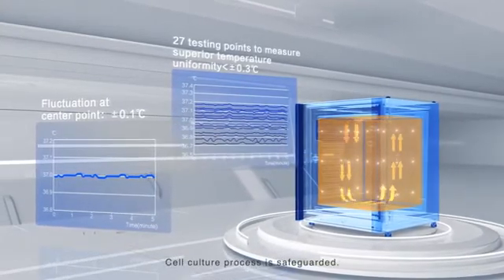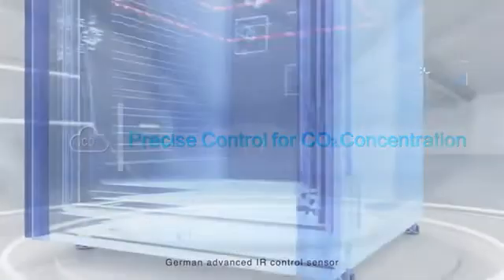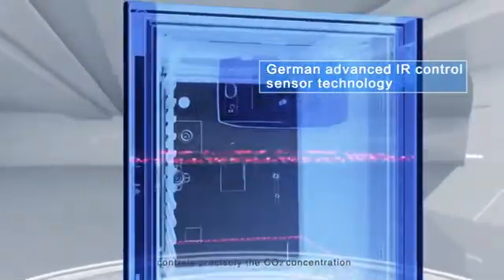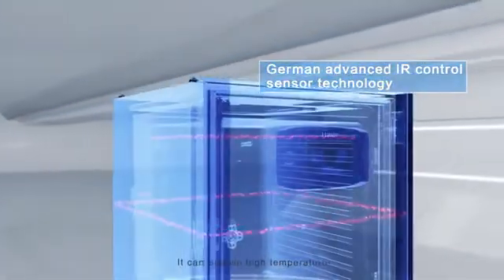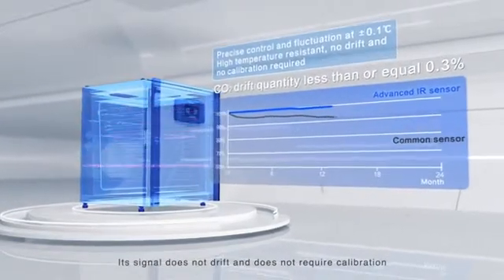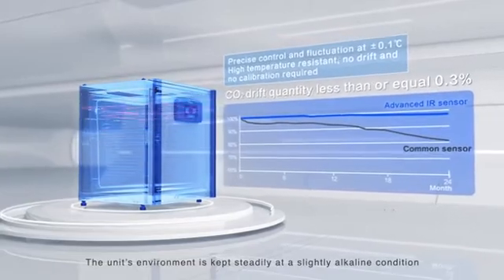Cell culture process is safeguarded. German advanced IR control sensor controls precisely the CO2 concentration. It can sustain high temperature. After its signal does not drift and does not require calibration, the unit's environment is kept steadily at a slightly alkaline condition.